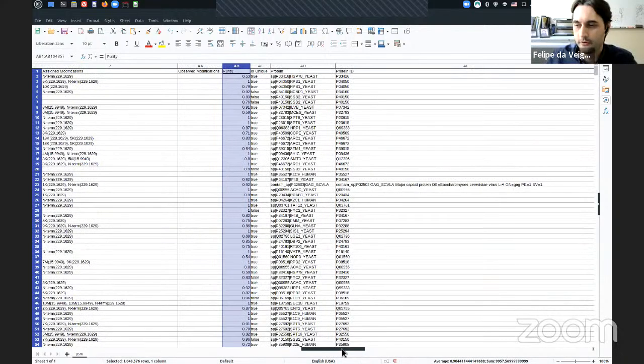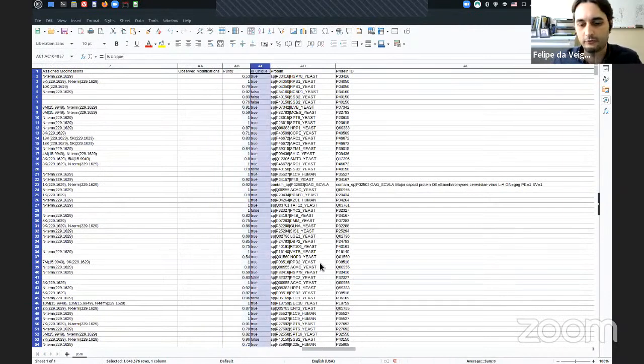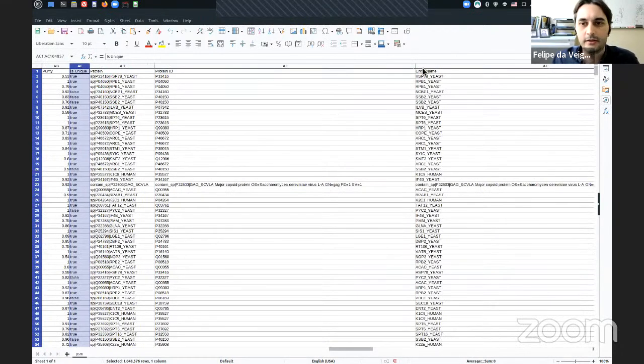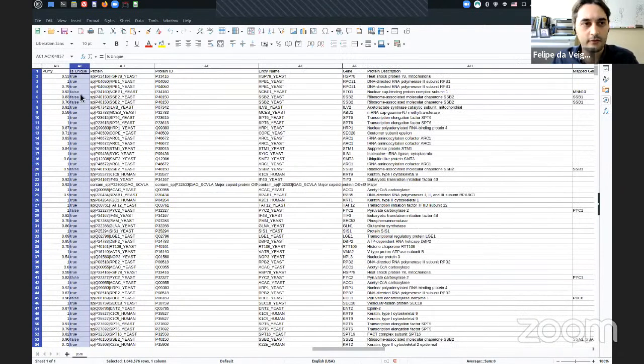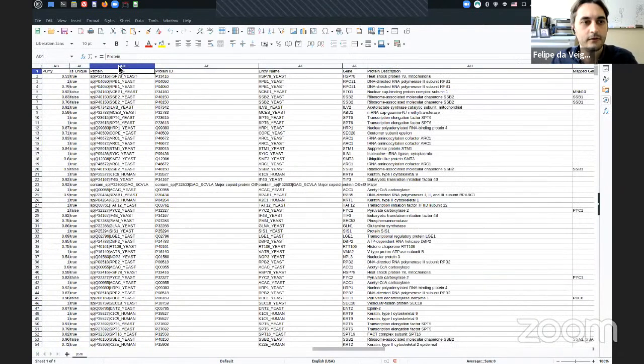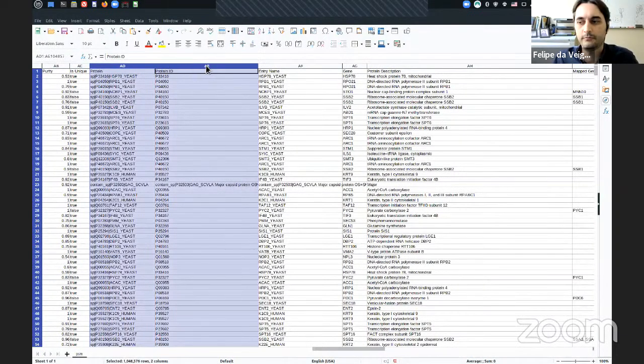All right, so yeah, we have this purity score. We also have this unique score that tells if the PSM is unique, and unique here means whether the peptide sequence is mapped into different proteins, more than one protein actually. We have this section here that tells more about the identification itself: the proteins that were mapped by those PSMs, the IDs, the entry names, the gene name.